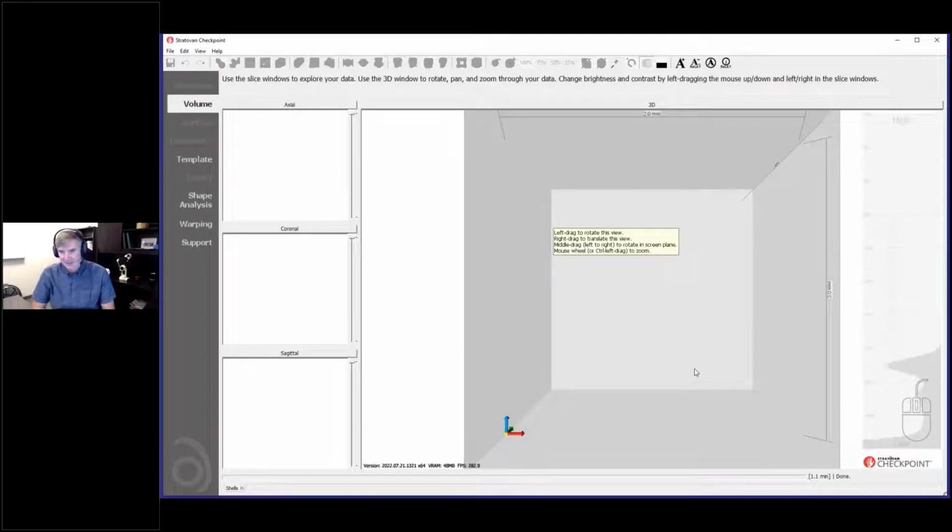So this is a big scan, so it doesn't normally go this slow. Again, this is about a 4 GB scan. So we've got to give it a little bit of time. It's coming. I can see the histogram coming.